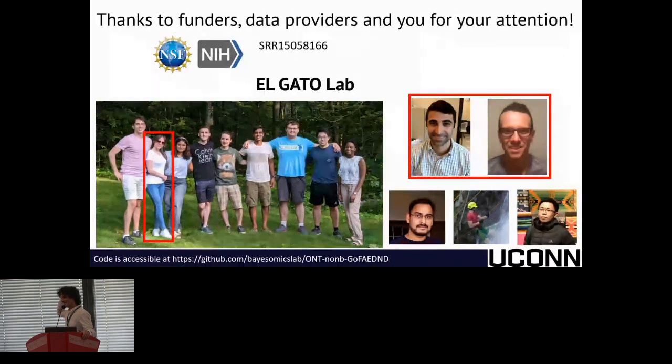Thanks for the talk. I'm wondering how biochemically stable these alternative structures are. At the point you're sequencing, there's been a library prep, there may have been a phenol extraction or a pull down of some kind. I remember quadruplexes being associated with metal ion binding or something like that. So if you're able to classify them with 100% accuracy in the sequencing, would that be the same as what you would see in a nucleus in a cell?